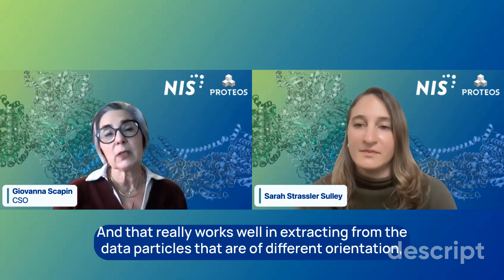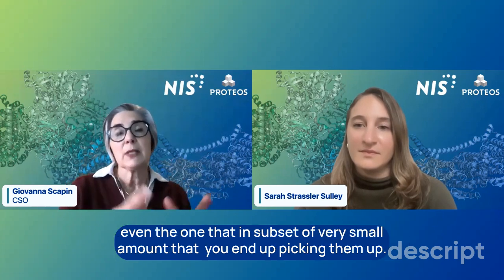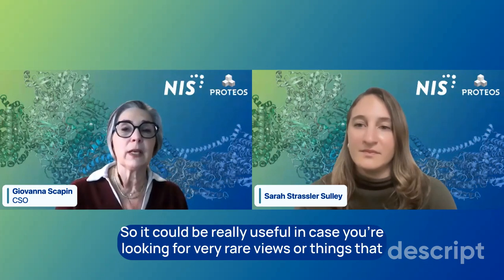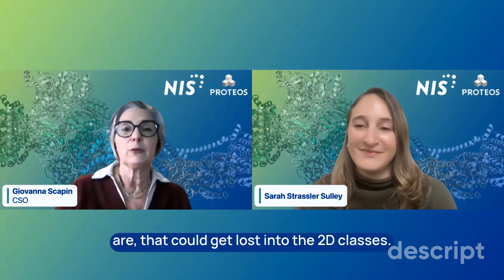And that really works well in extracting from the data particles that are of different orientation, even the ones that are in a very small subset, you end up picking them up. So it could be really useful in case you're looking for very rare views or things that could get lost in the 2D classes.